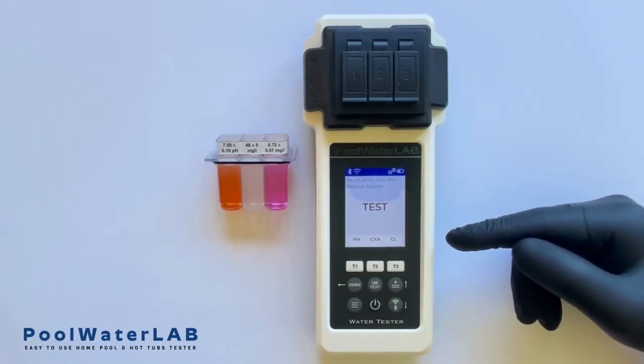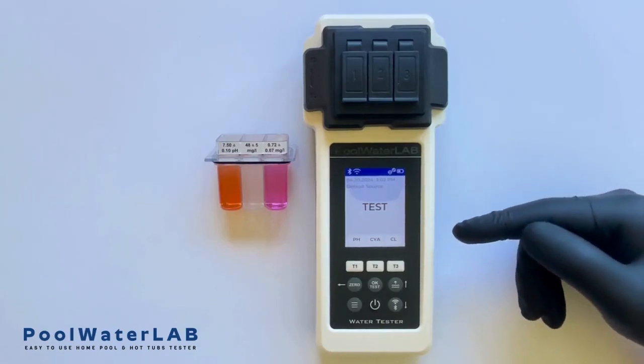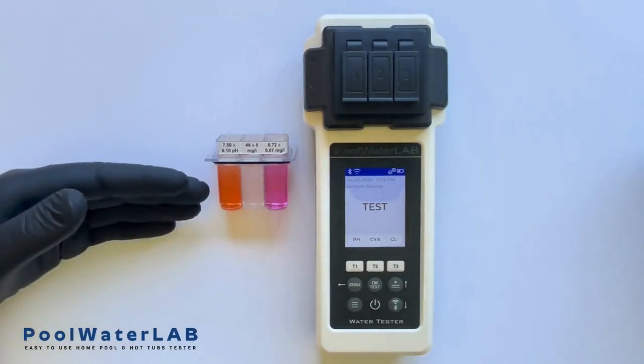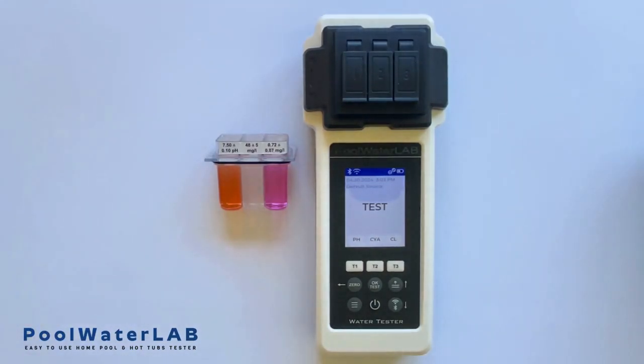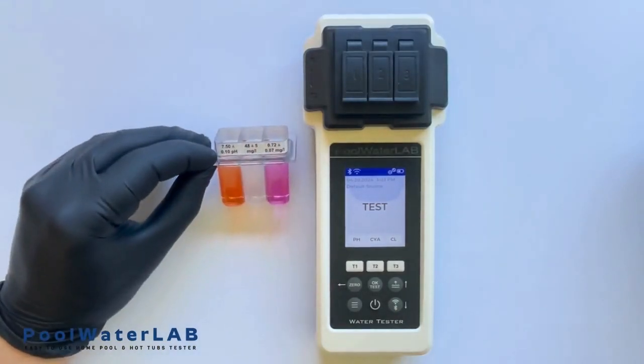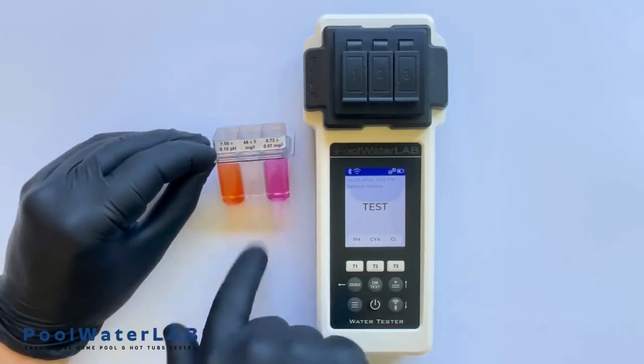If you want to accurately assess the precision of any device, you should first order the necessary sample tests from a laboratory and only then evaluate these samples for accuracy. In our case, we have samples that have been produced and verified under laboratory conditions. Specifically, these include pH, CYA, and free chlorine levels.